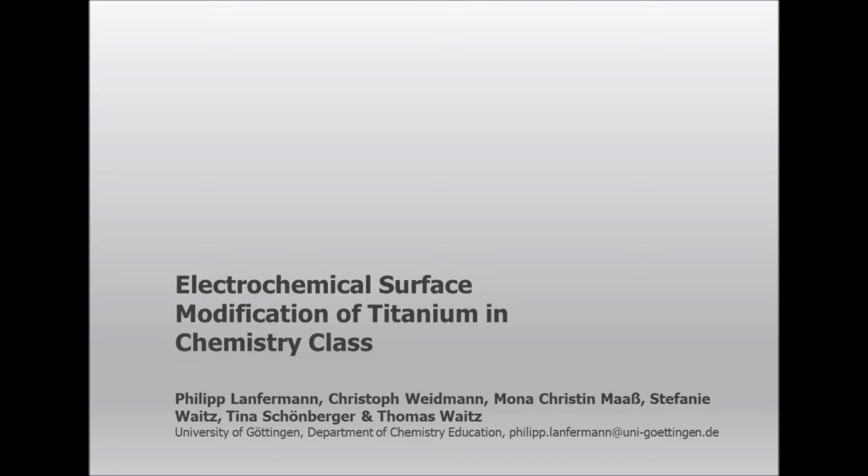Welcome to our talk titled Electrochemical Surface Modification of Titanium in Chemistry class. In the next few minutes, we will present several experiments that are concerned with the anodic oxidation of titanium metal and its uses as a surface modification method, and highlight the educational possibilities of these experiments.